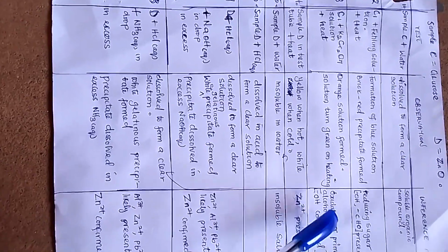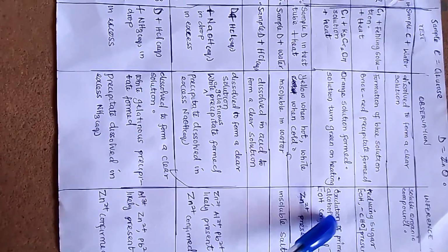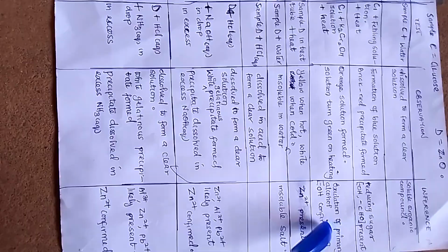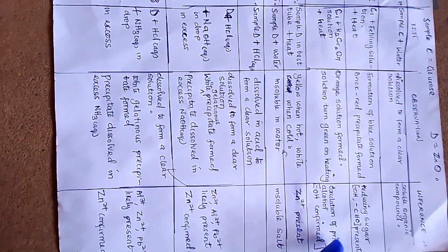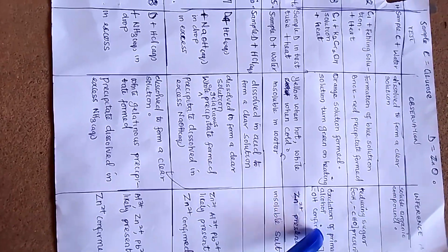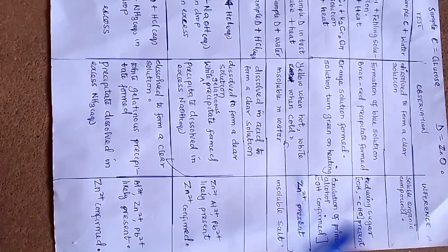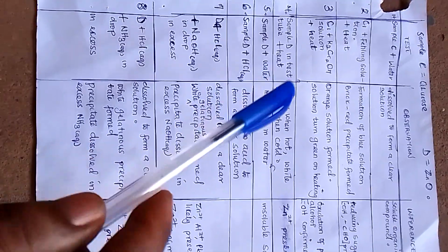That kind of change normally happens when you mix potassium dichromate with an alkanol. Potassium dichromate is an oxidizing agent. So that shows the confirmation of OH as the inference. We have the confirmation of OH as the inference here. So let's look at the next step.